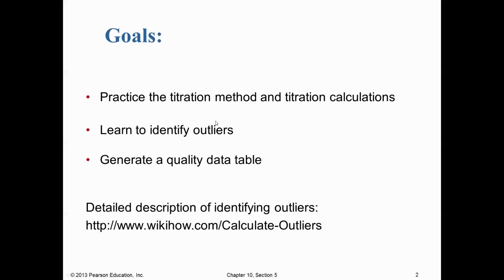And so another important skill I want you to gain from this lab is to learn to generate quality data tables. So making data tables is one of the most important skills you can pick up from a science class, and so we're going to be practicing that here.